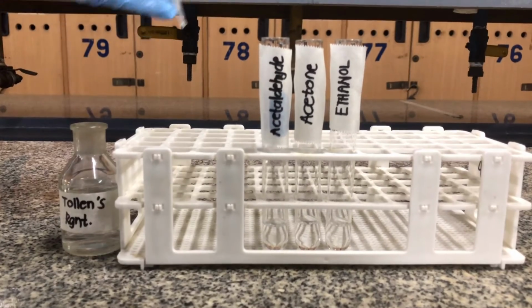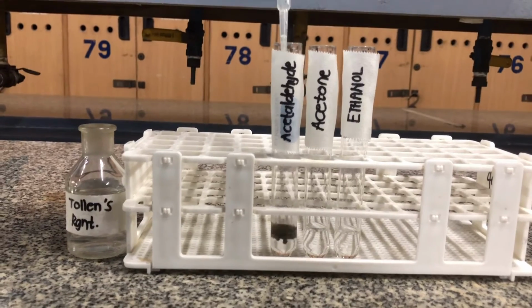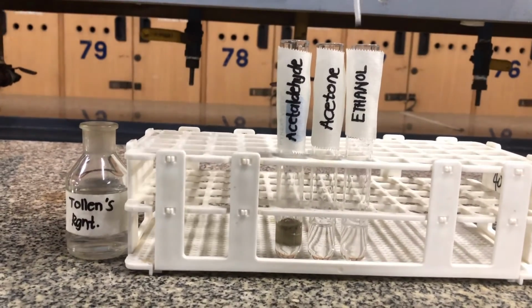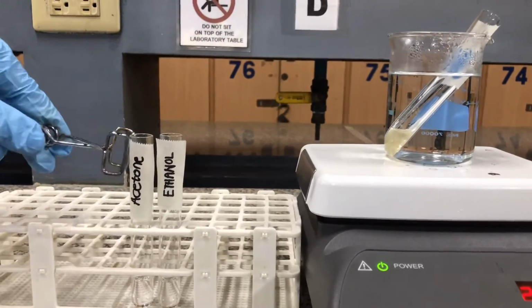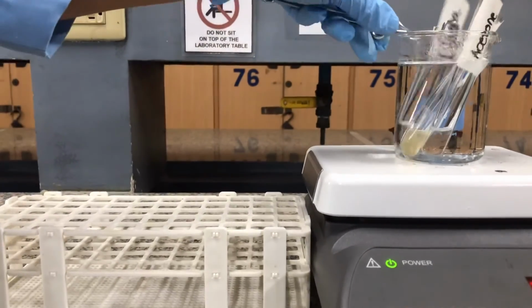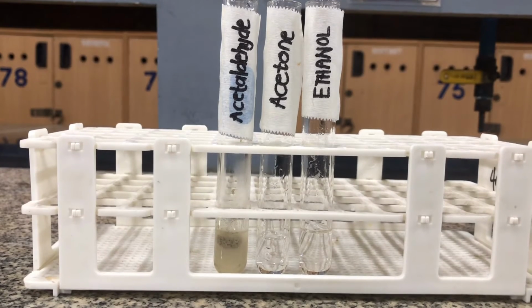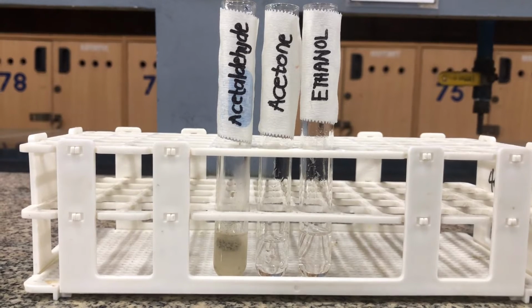The test is conducted by adding 1 ml of the Tollens reagent into the test tubes already containing 1 ml of acetaldehyde, acetone, and ethanol respectively. The test tubes were then shaken and heated in a boiling water bath for 2 minutes. After heating the mixtures for 2 minutes, only the aldehyde was able to produce the positive result, which is the gray precipitate.